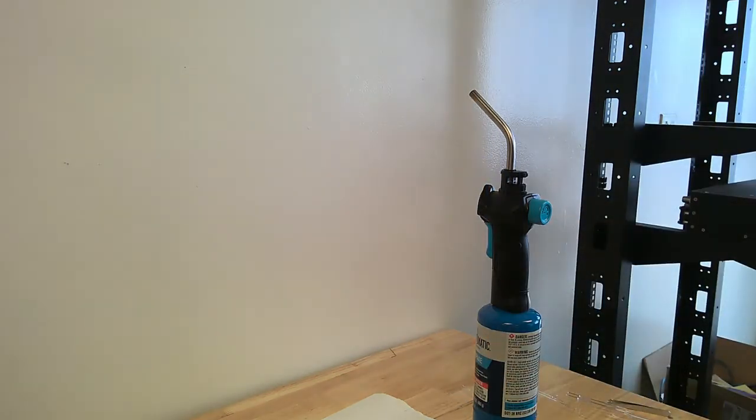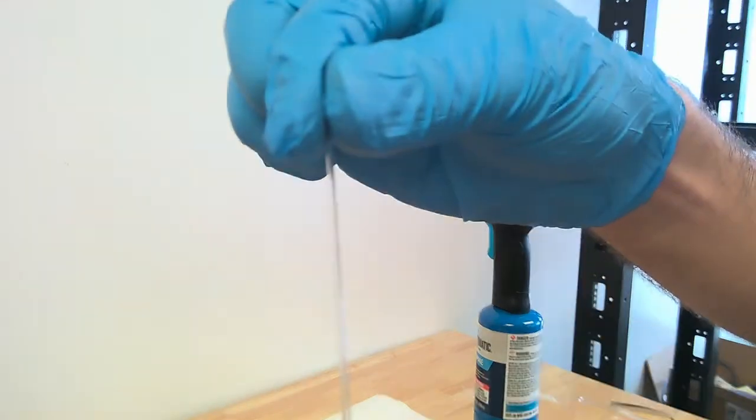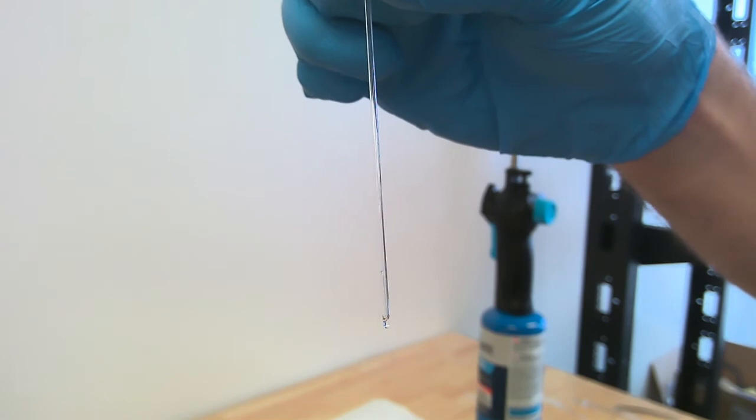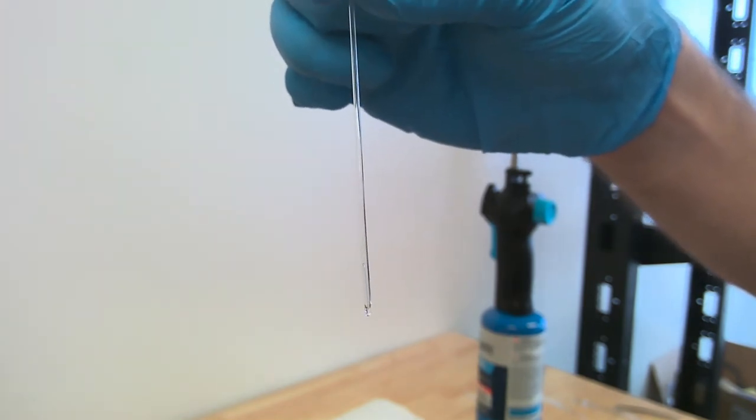Allow me one moment to do that. Now, if everything goes well, the capillary bell will fit inside your capillary tube, and it will be open end down. Notice you want your capillary bell to have a little bit of weight to it, so that it doesn't get ejected when your sample boils.